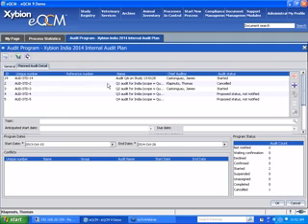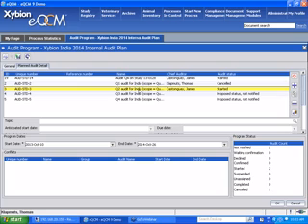And then when you come into the details, you plan out your audit. And so instead of going through the audit plan for each of these, you can copy them. And so that's why here I have quarter 1, quarter 2, quarter 3, quarter 4. And so you can automatically generate these to make it more streamlined.